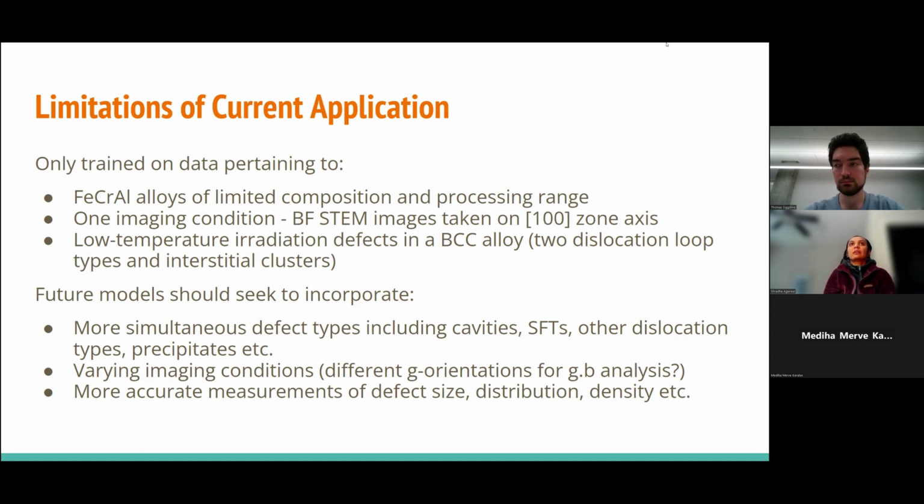Because I was just thinking, when you do semantic segmentation for easier projects, like if you have to do cavity and voids, where you don't care whether this is cavity 1, cavity 2, or cavity 3, all of them are cavities, maybe going through a simpler model is a good first step when we do these kinds of experiments. Other than that, I have a question on the architecture.